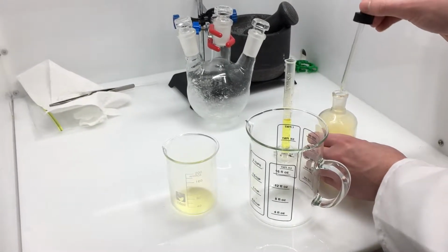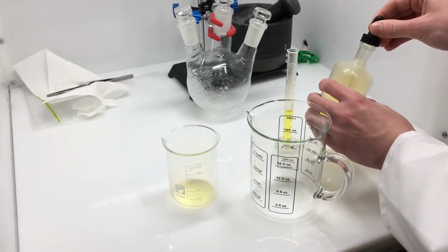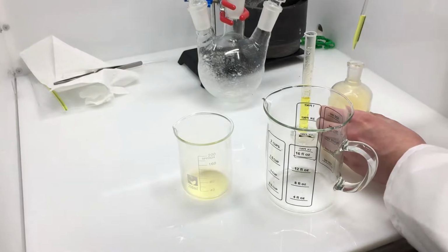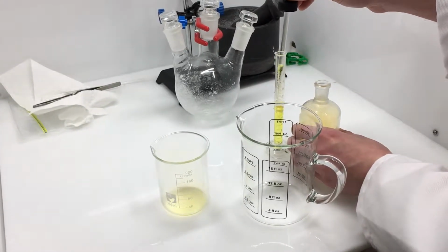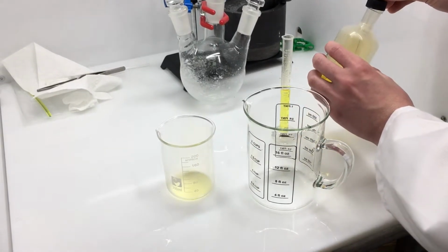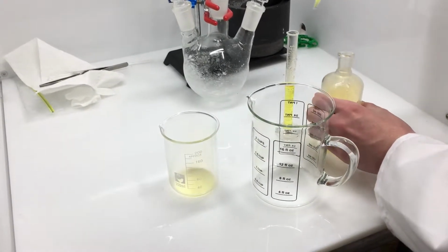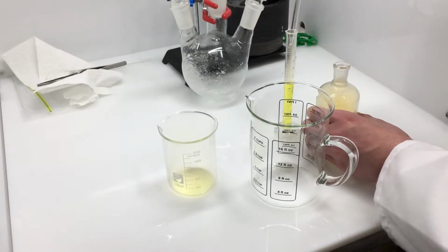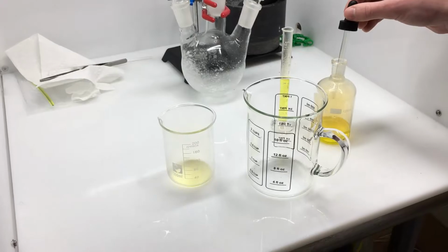I would like to say, at this point it is a good idea not to wear gloves if you're working with fuming nitric acid, because remember, it will ignite your gloves. So don't wear them, as I am in the video, but later I do put them on when I get out the sulfuric acid. I figure it's just a good trade-off because I'm working with sulfuric acid that could burn my skin.